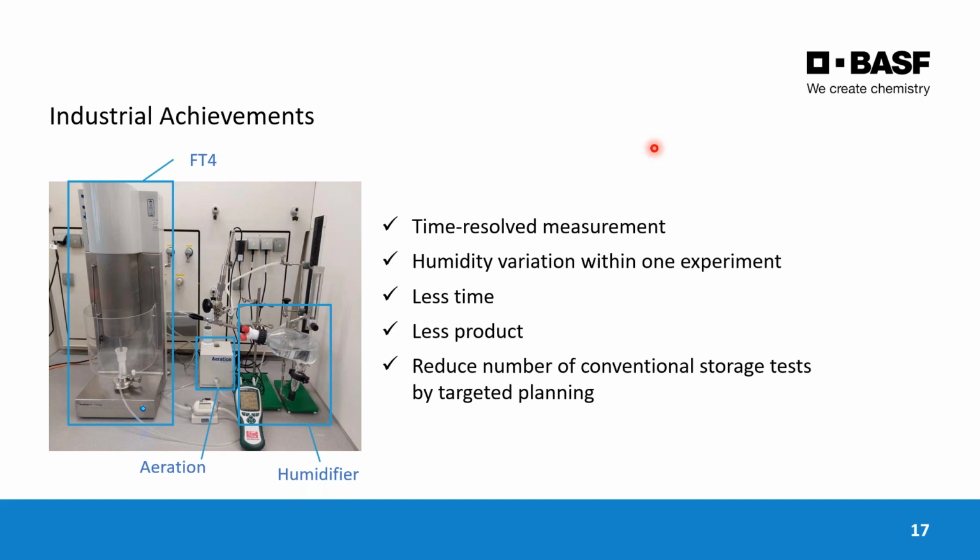So we've got time resolved measurement. We can vary the humidity, with less time and less product, and we can reduce substantially the number of conventional storage tests by the targeted planning of this approach.